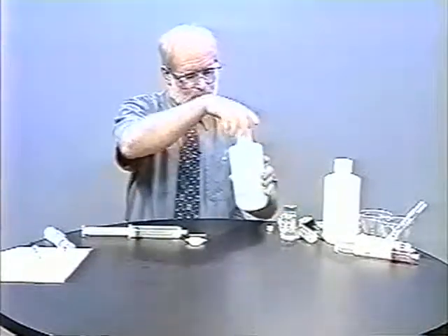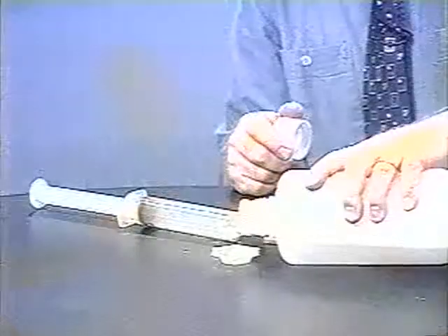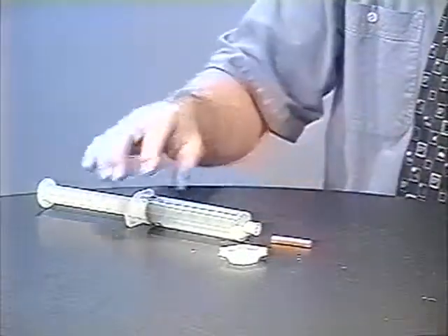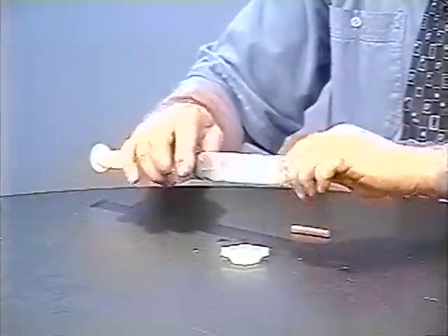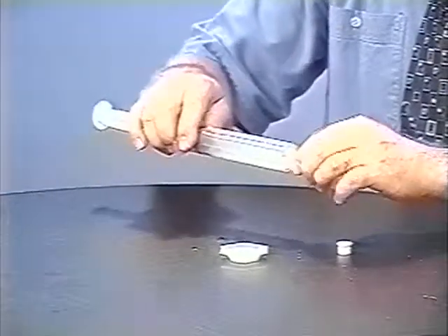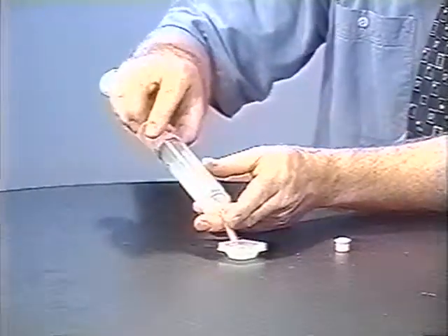To transfer the gases to a soap bubble solution, I'll use either transfer tube. This is a solution of 3% Dawn, which is right from the kitchen, and I can make a nice mound of bubbles. This is called dynamite soap, and it'll make a loud bang if I were to ignite it.